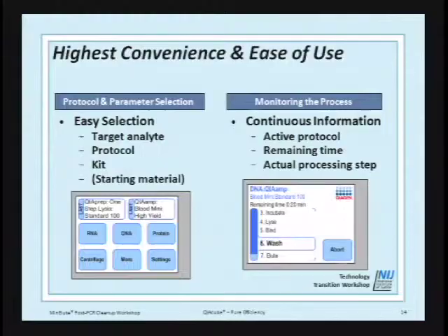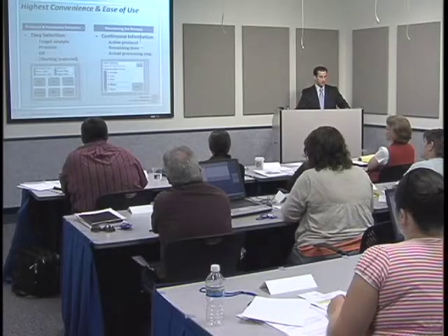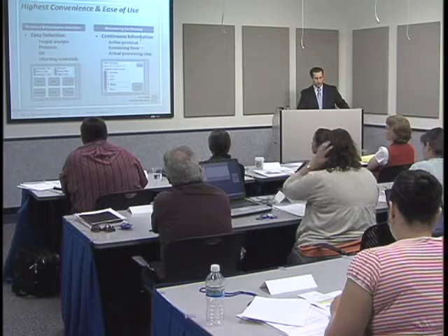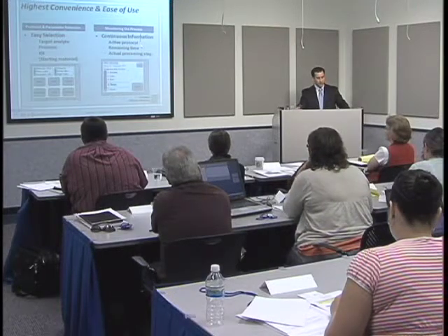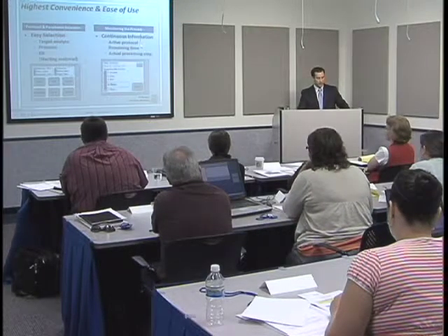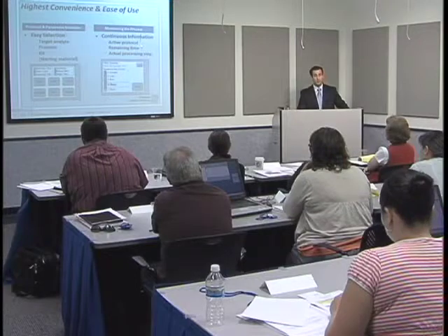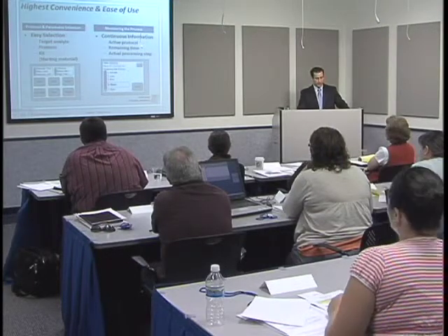When you're setting it up to go, you basically pick the protocol that you're running. It's pretty user-friendly, so whether you're doing RNA, DNA, protein, or cleanup, you press the screen for the specific protocol you'd like to run, go into that protocol within the cleanup DNA or RNA list, and press start.